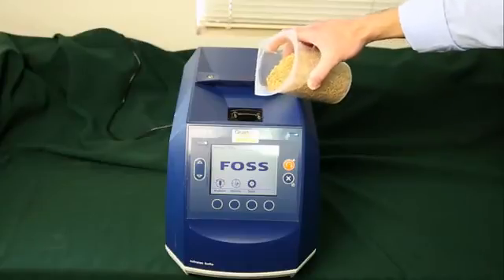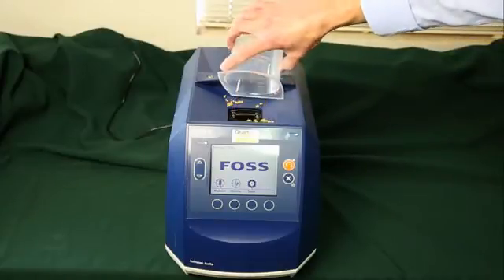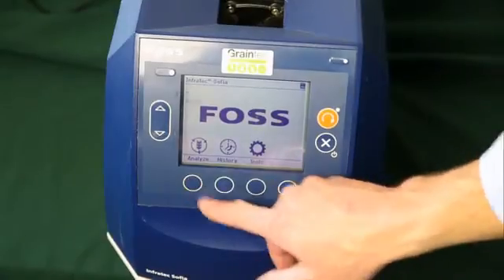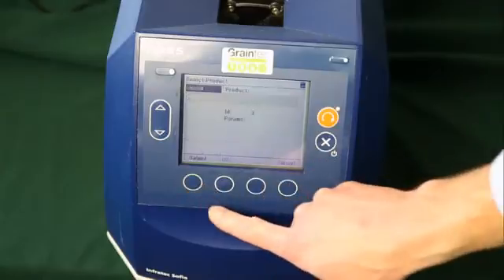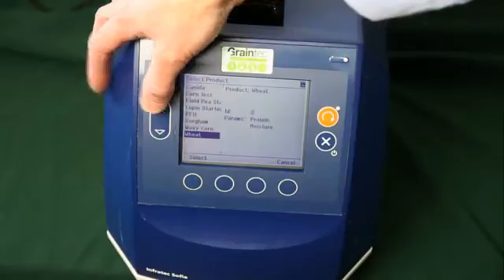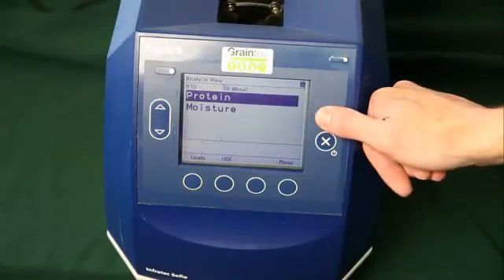We just pour in our sample. The sample is about 400 ml. We choose our grain from the menu. In this case we're going to measure wheat, and then we just press the measure button.